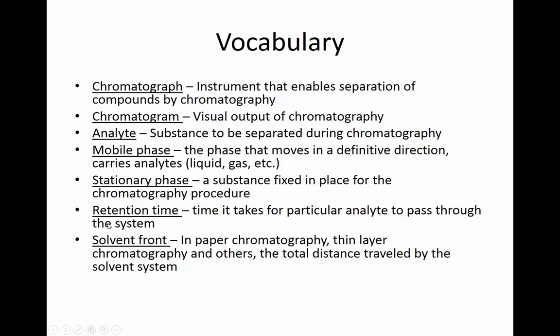And retention time is essentially the time it takes for a particular analyte to pass through the entire system, to pass through the column. And so you'll be determining retention time in your lab this week. Retention time of molecules that are coming off this size exclusion chromatography column.